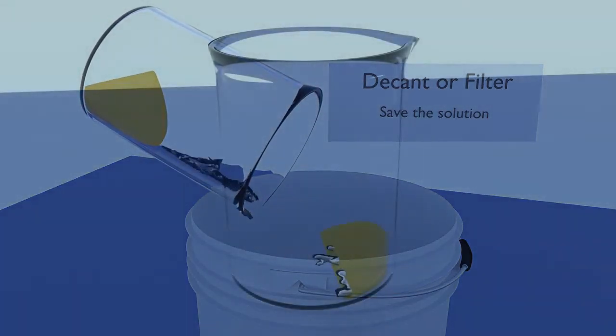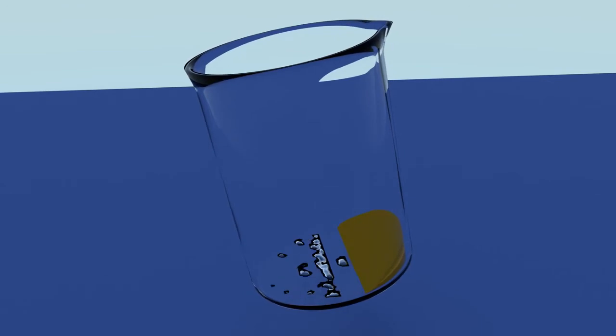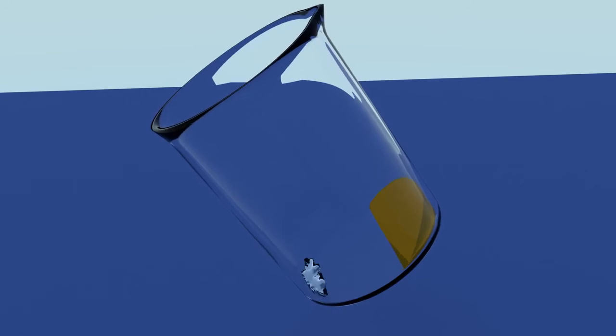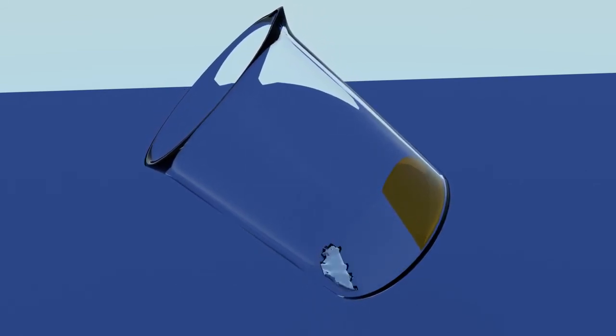A small amount of water will cling to your gold mud. We'll take a few drops of that water and test it for impurities. Tilt your beaker. Water will drip off the mud and then puddle in the corner of the beaker. Take a sample from the puddled water and place it on a spot plate, mirror, or paper towel.